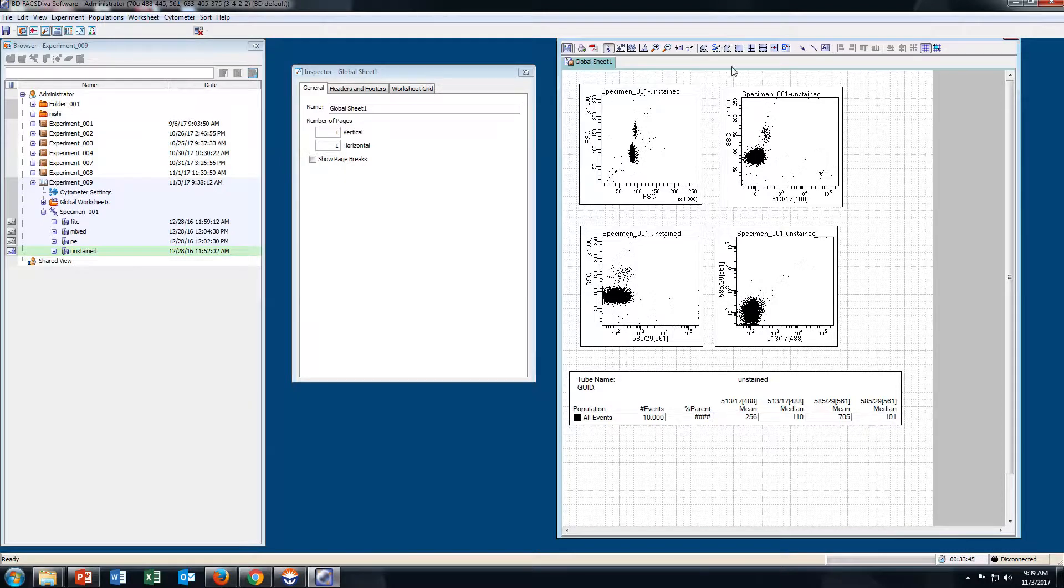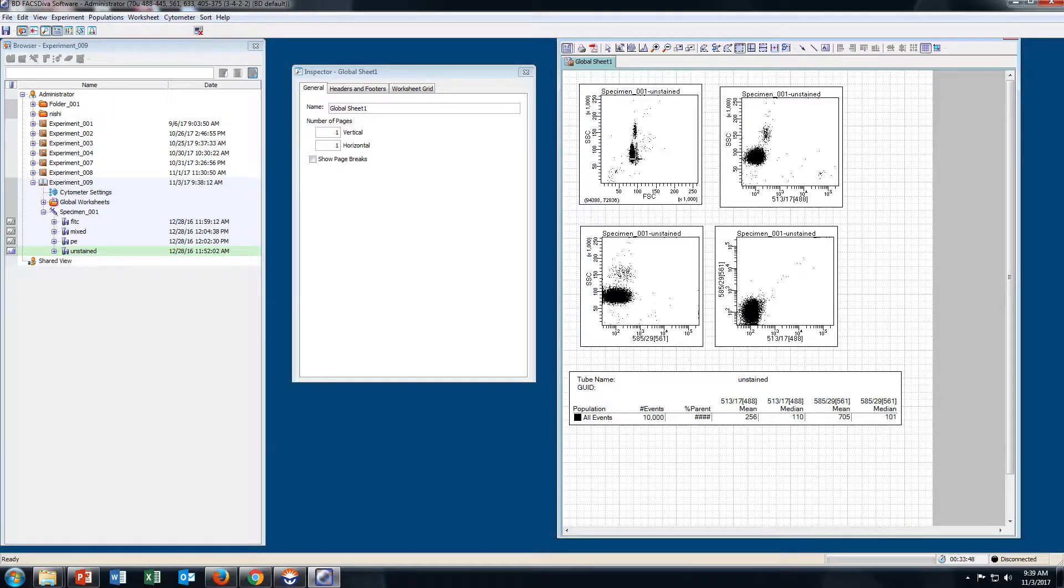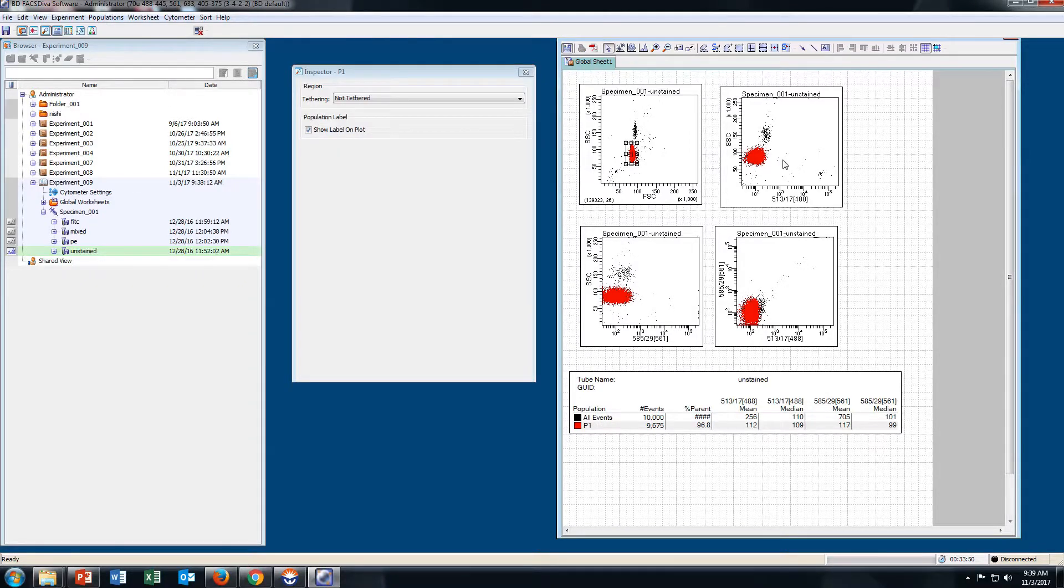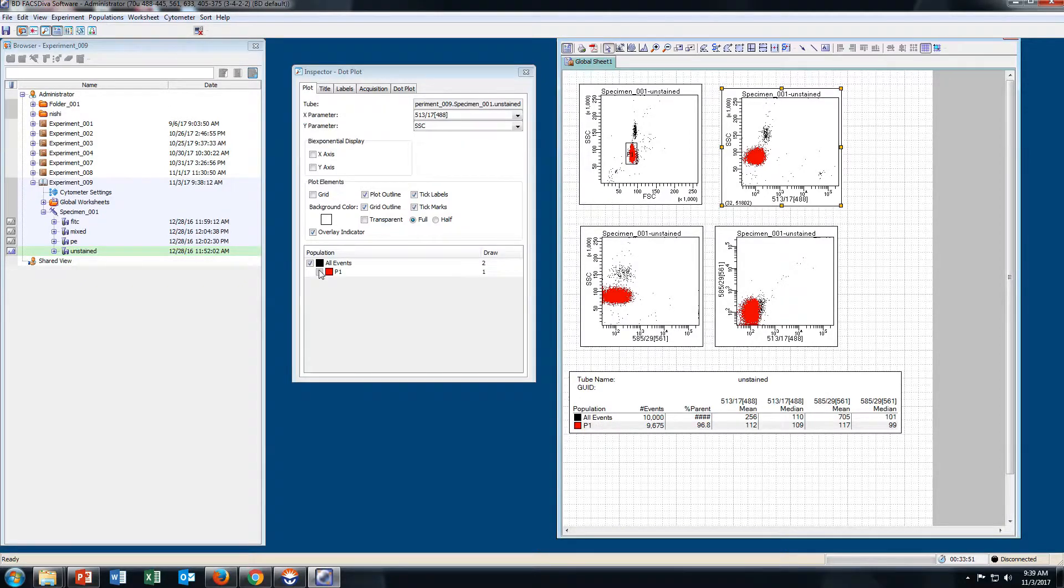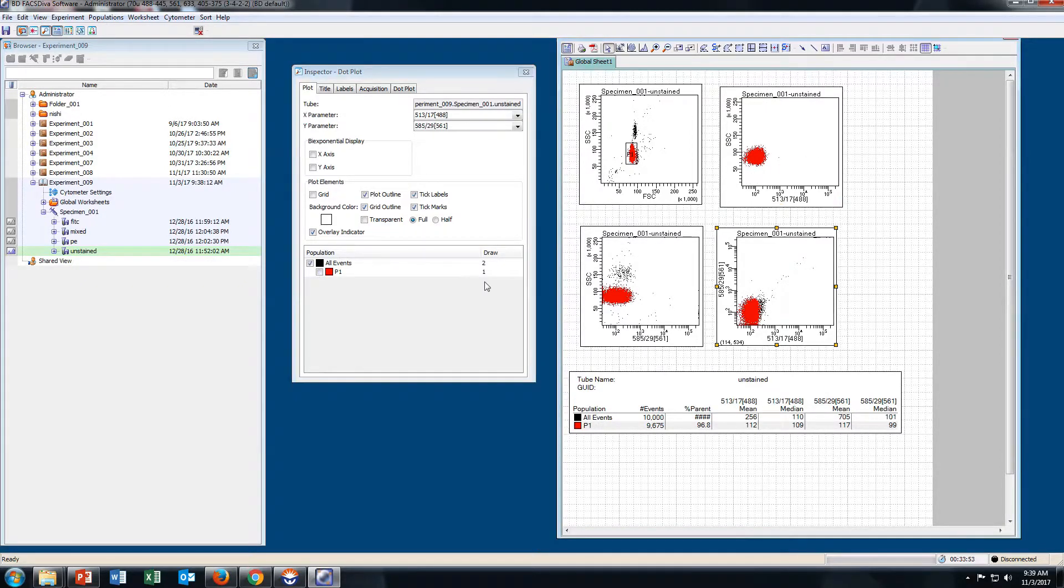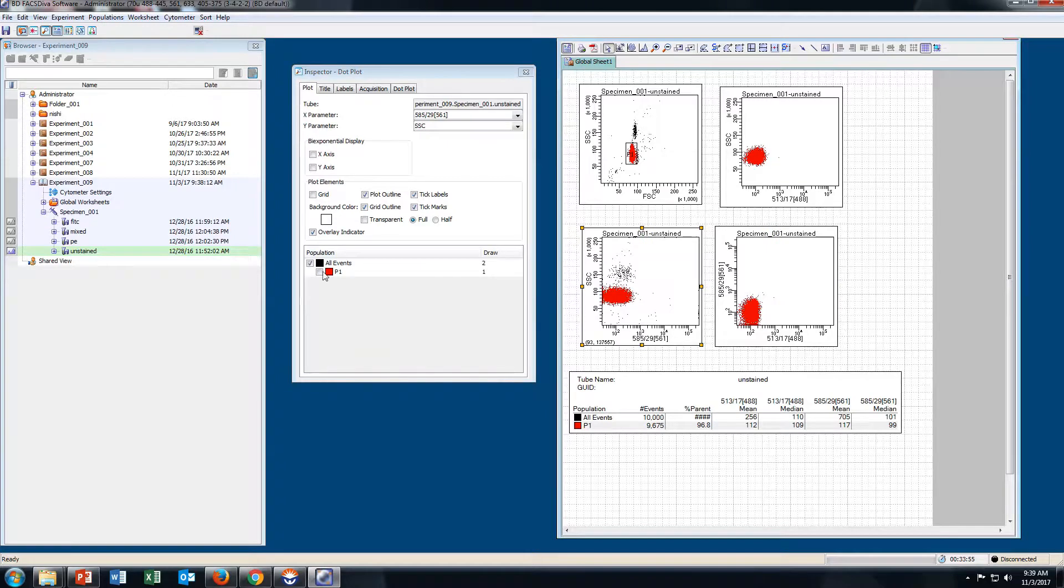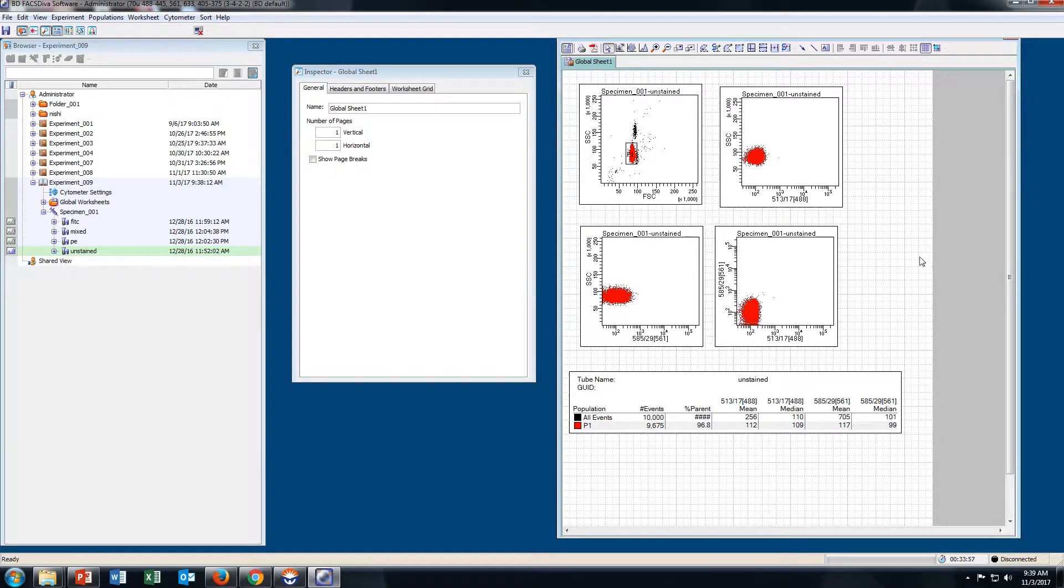Now for gating, I will take a Rectangular Gate. This is your Unstained sample.